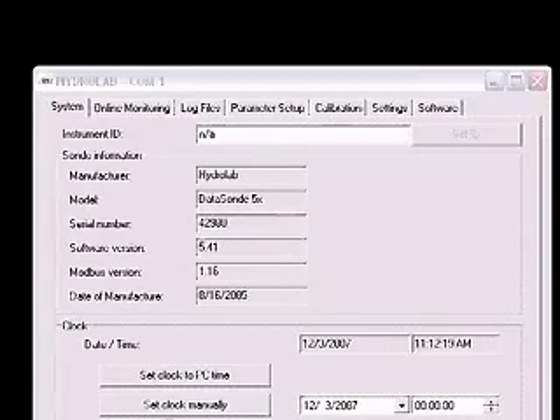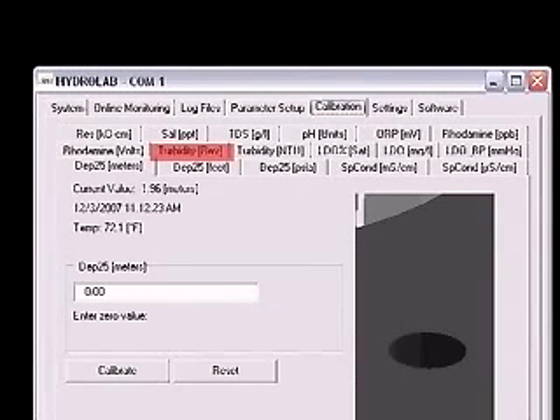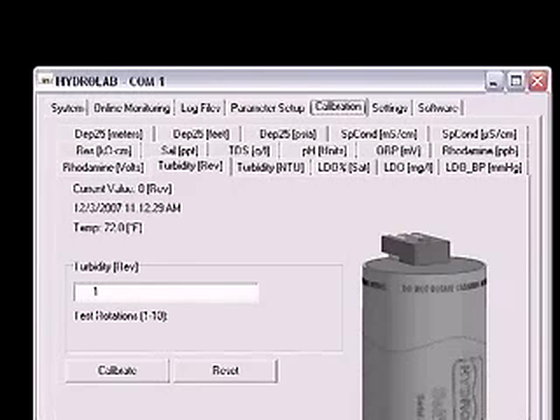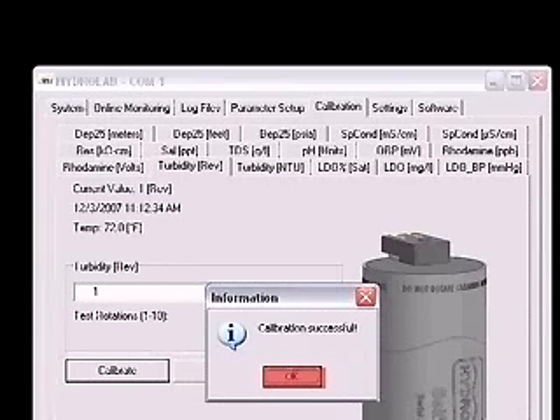The end of the self-cleaning turbidity sensor should be fully submerged. Again, in Hydrus 3LT, click on the Calibration tab, then click on the Turbidity Rev tab. Verify that the value in the box is 1 and click the Calibrate button. The wiper should make one complete revolution, removing any air bubbles from the optics. Click the OK button in the Calibration Successful window.